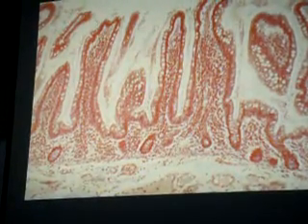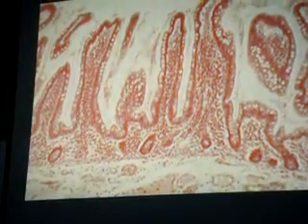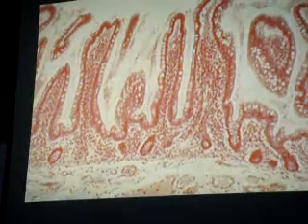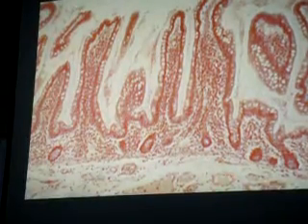Classify pointed tissue. Be specific. What is this? Those. What are those? What is inside? Those are actually what? Blood vessels. So, classify pointed tissue.